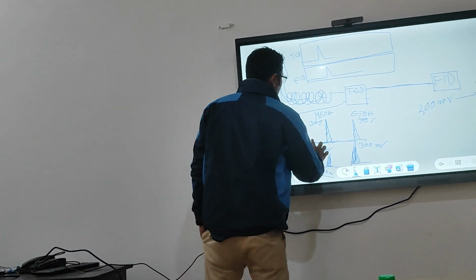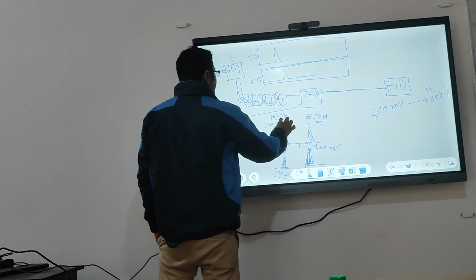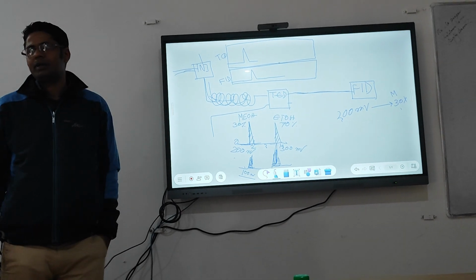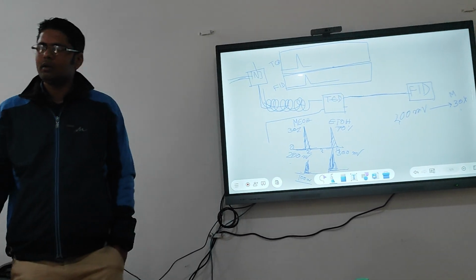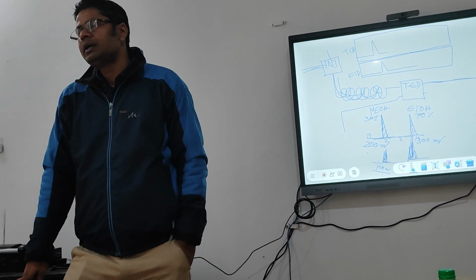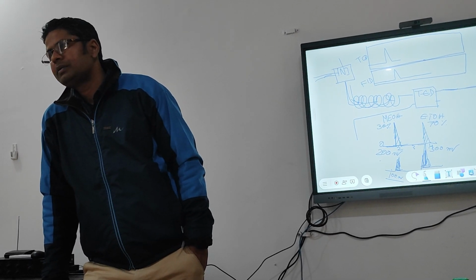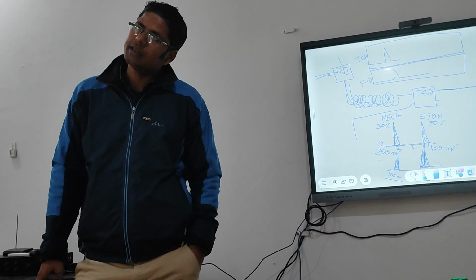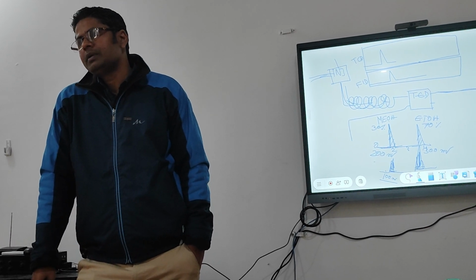Say at 2 minutes, every day you will get the methanol peak. If you don't change the carrier gas or temperature, the instrumental parameters, then you will get the same peak at the same time every day. Your timings will not change. That is called retention time.